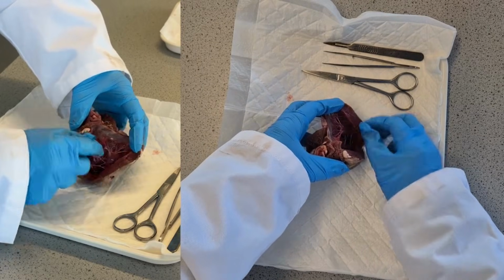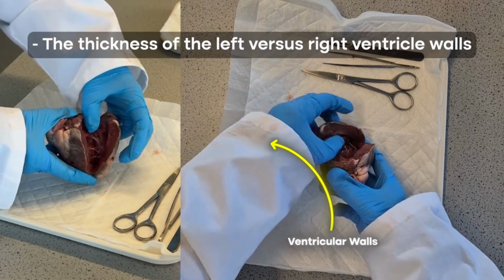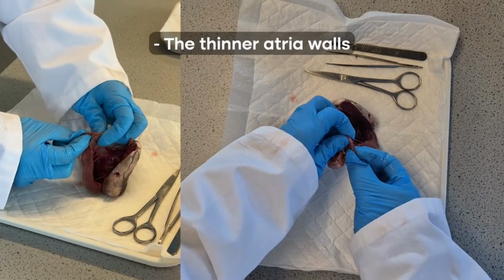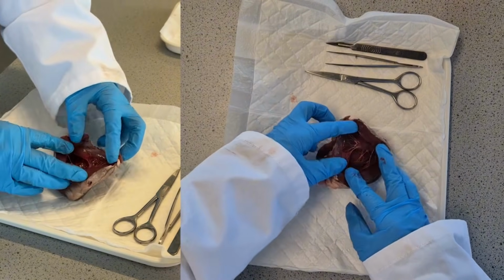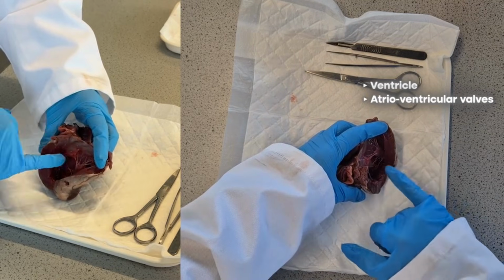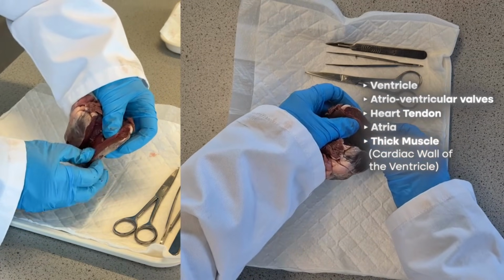The next thing is looking at and pointing out to the students just how thick that wall is. So this is your ventricular wall, or the wall of the ventricles, made up of cardiac muscle. And we can see that's a really thick layer, especially if we go back and have a look at the atria where it was this really thin layer in comparison. So again, I'd get them to take a photo, because when it comes to doing their scientific drawing, these are the sorts of things they'd need to be able to label. That this is the ventricle, that this is an atrioventricular valve, we've got a heart tendon, we've got the atria, and I'd be getting them to label, or they would need to know, that this is the thick muscle of the cardiac wall of the ventricle.